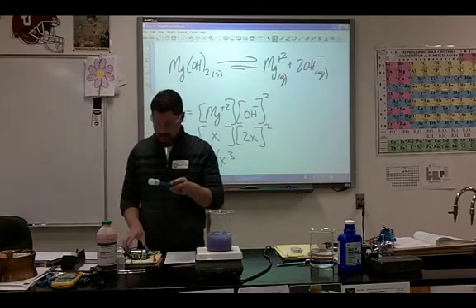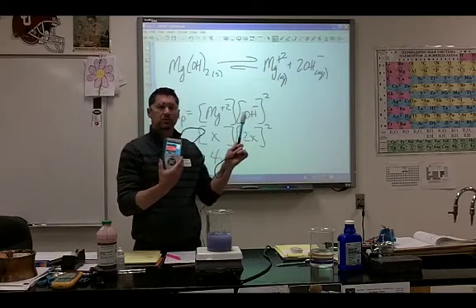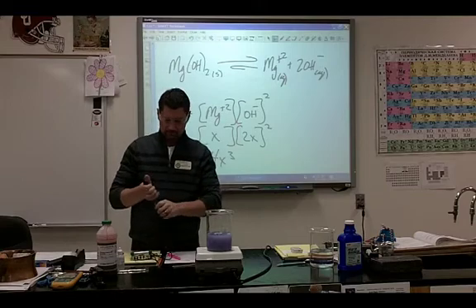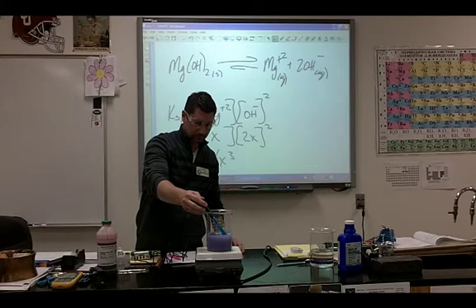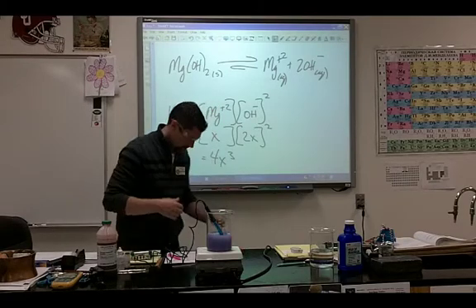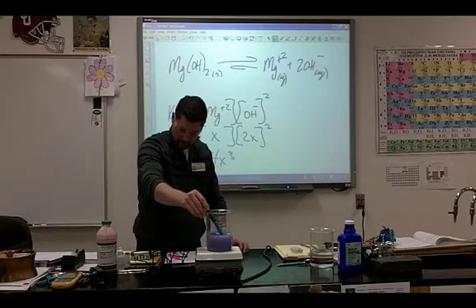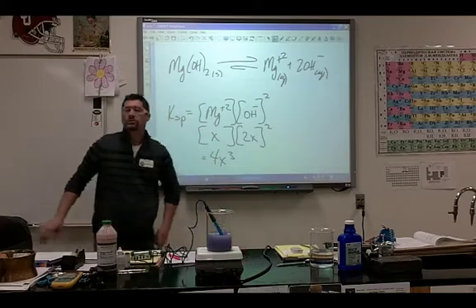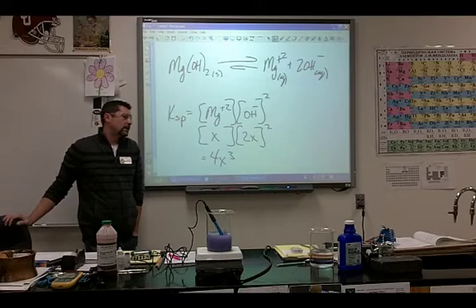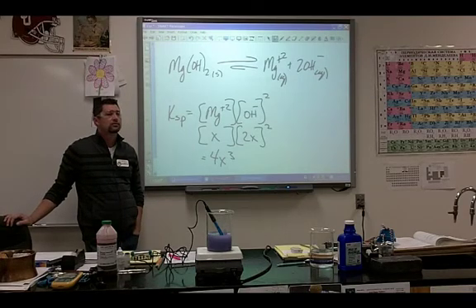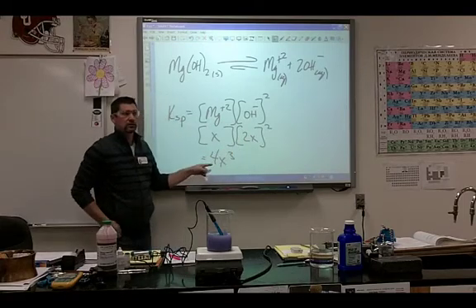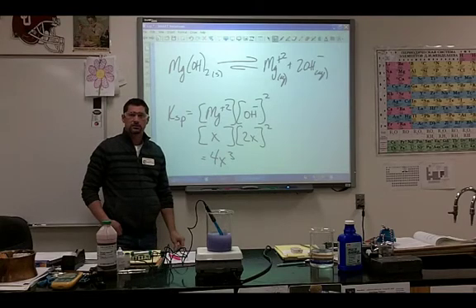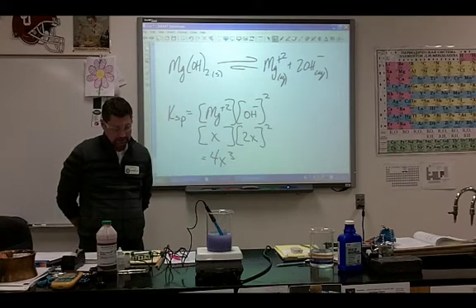Now I'm going to do something a little bit different. I have right here a lab quest. And it shows me what the pH is. So I'm going to dip my probe in it. Any guesses? Twelve. I'm going to dip it in. Eleven. And I need to let it stabilize. Okay. Still climbing. Still climbing. Still climbing. By the way, once I figure out the pH, how does that help me in this problem? You can find OH. You can find OH. And if I know OH, I can figure out X, right? And if I have X, I can figure out KSP. Does that make sense? Mm-hmm.